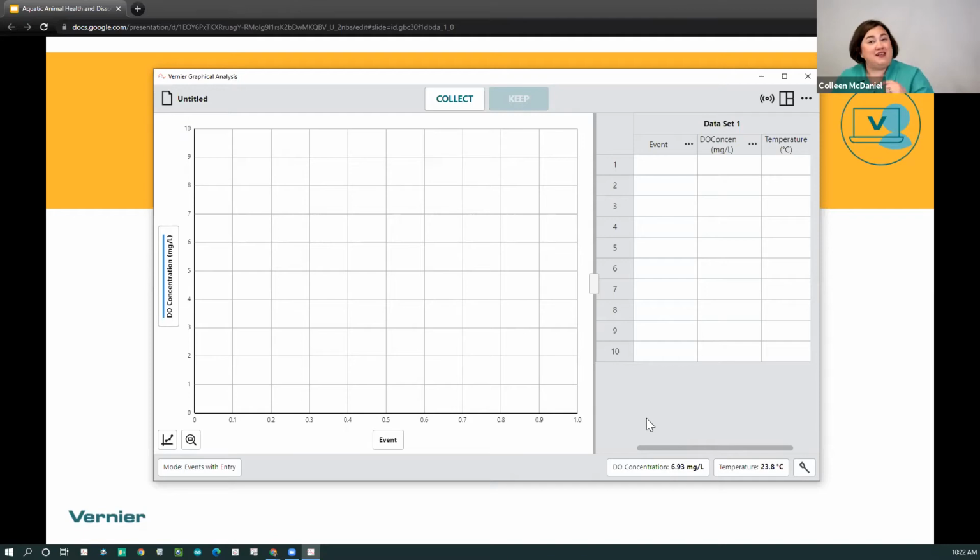The number one thing I see people do with this experiment that they don't get good results on is they don't do the shaking part. The shaking part is critical. A lot of times people will just measure the dissolved oxygen of the water in the beaker. That oxygen level is going to be set no matter what temperature the water is, because you haven't tried to introduce any more. So it's very important to make sure that you introduce the right amount of oxygen in there, and that's how we have to do this agitation process.